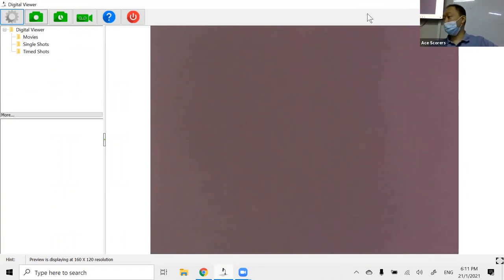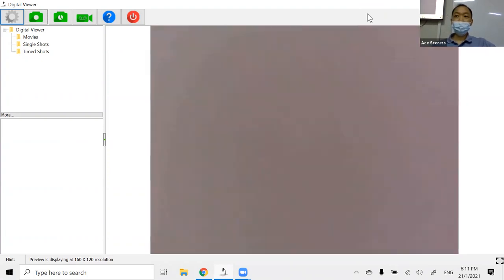So how small can it go? It can go up to 1,000 times. Is 1,000 times big? Is it able to see the cells? No. You need like 5,000, 6,000, 10,000 to see them. But this will be quite good, right?